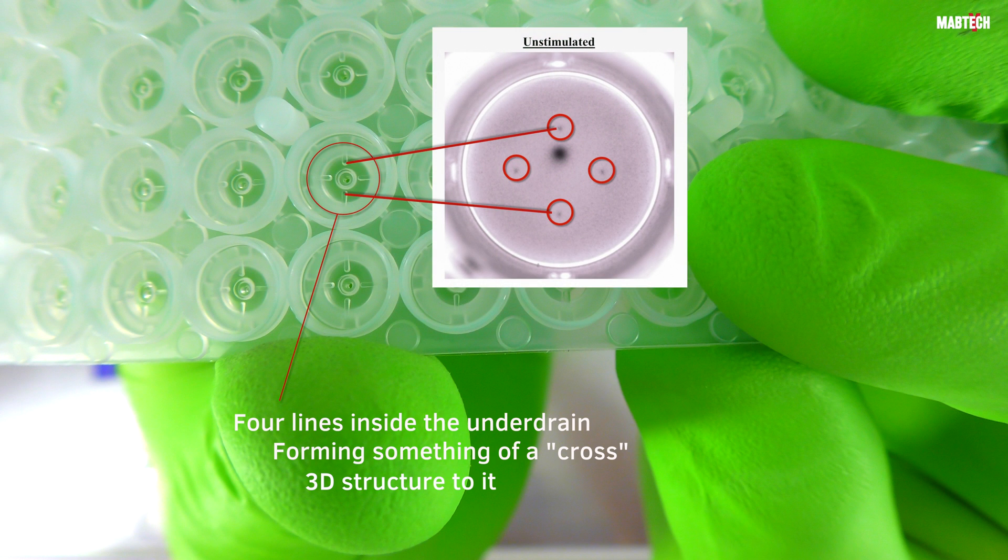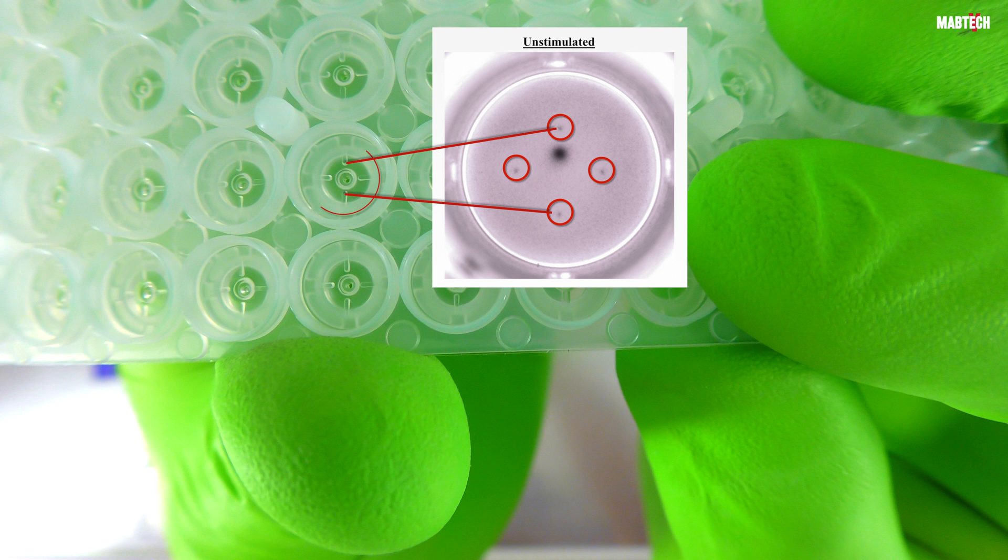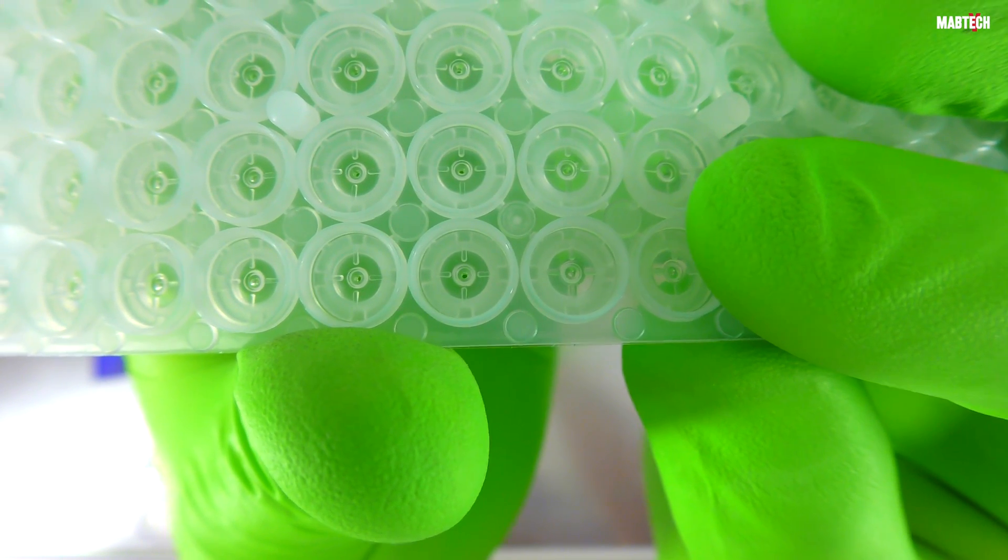The highest points of the cross coincide with the placement of the membrane artifacts shown earlier. In essence, this is the point of contact between the underdrain and the PVDF membrane if the plate is handled incorrectly somewhere during the assay.